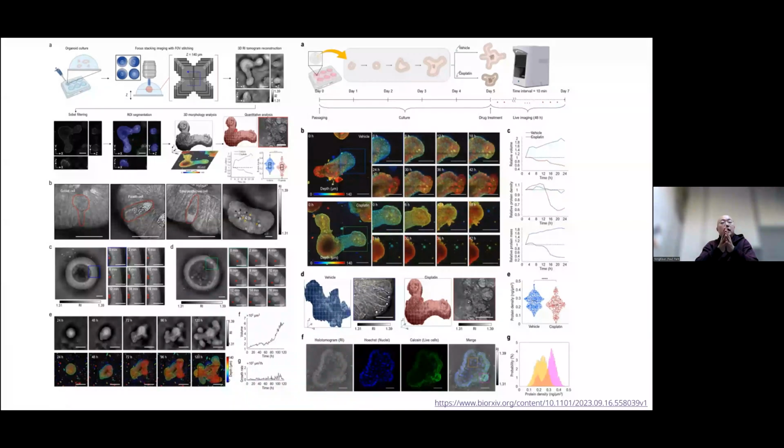I have to say that HT is a relatively new technique, and it has some potential, but we have very limited publications from ourselves and our users. So I think there are many potential opportunities for investigation. For example, for these questions of cellular apoptosis, we have detected some events here, but if you ask whether they can be automatically detected by software, I think that's the way to go.